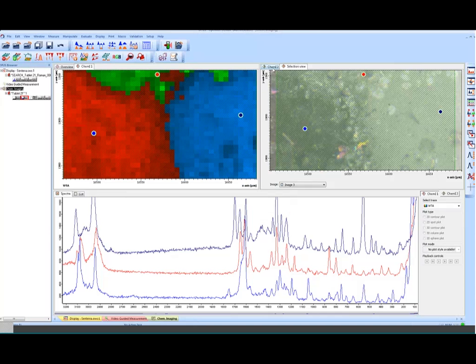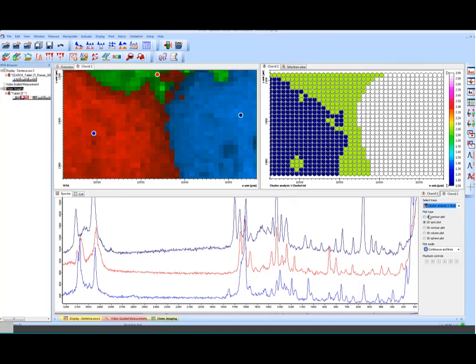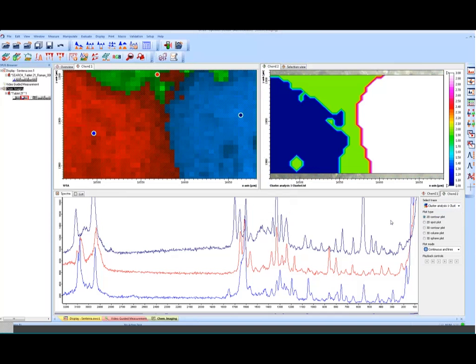So for this, we have a chemical image window of the same value as on the left side. So what we have to choose is here the appropriate trace. Let's check out here. So here we have a nice comparison between the right and left procedure. On the left, we have done some integration. On the right, the clustering has provided also a quite nice result.